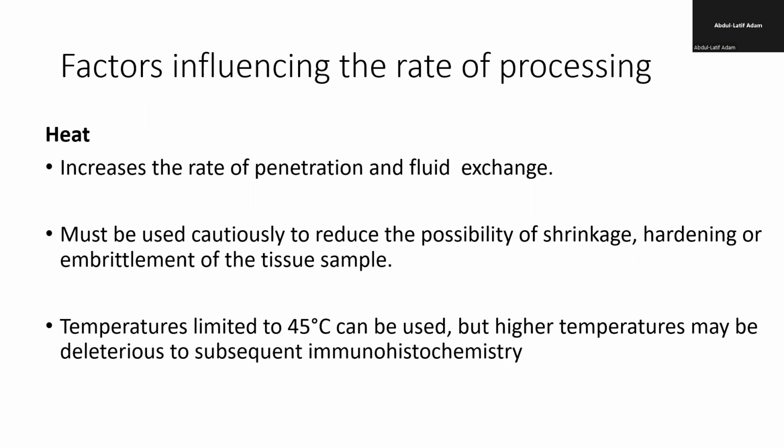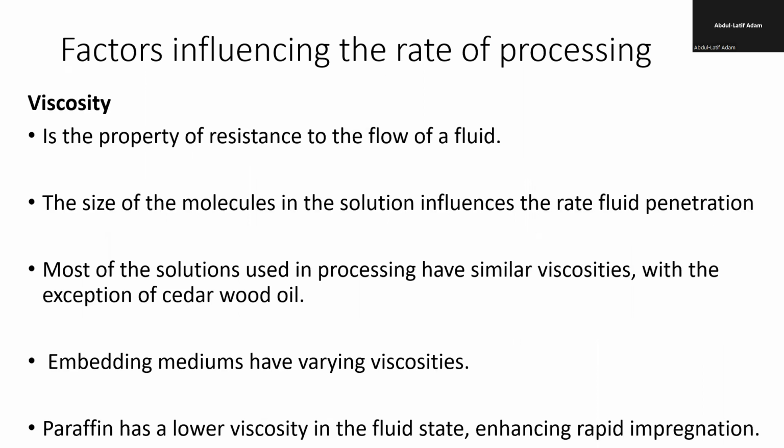distort the protein. So if you want to do special techniques on it, like immunohistochemistry, you'll not be able to do it. And it can also affect the DNA. And if you want to do molecular testing and other things, it will distort it. So you have to be sure that there's not so much heat that will cause distortion to the tissue.